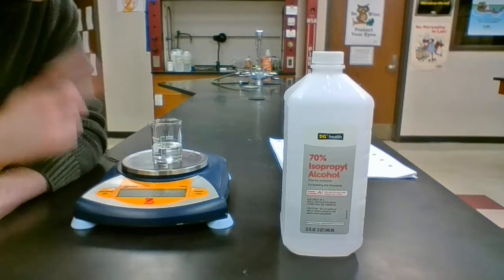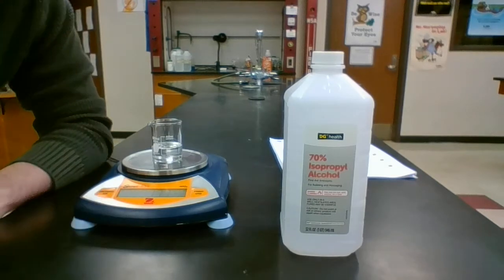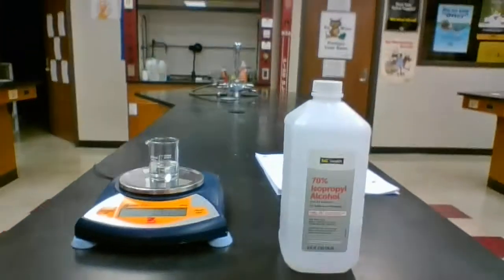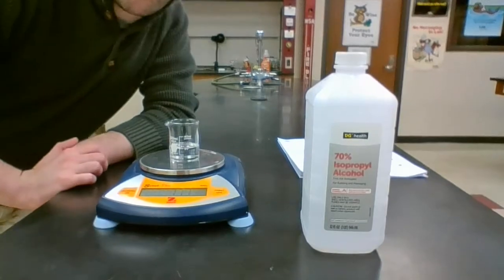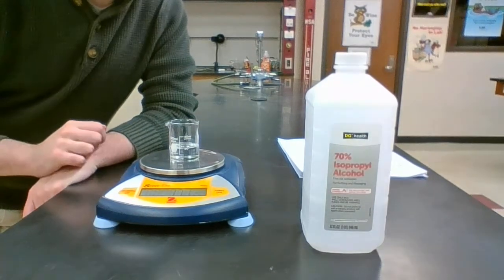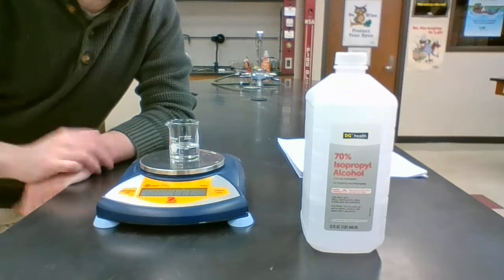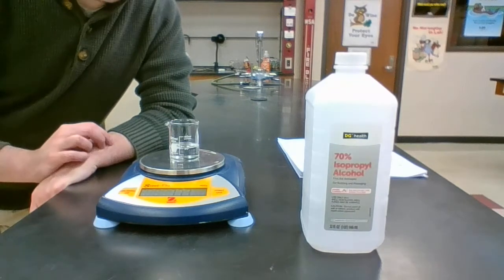Okay, now this 20 milliliters of rubbing alcohol has a mass of 17.1 grams. I'll try and get a little bit closer to the scale so you can read it. Okay, so if I have the mass and the volume of this rubbing alcohol, I can calculate the density. Density is just mass divided by volume. So my 17.1 grams divided by my 20 milliliters should give me the density of this 70% rubbing alcohol.